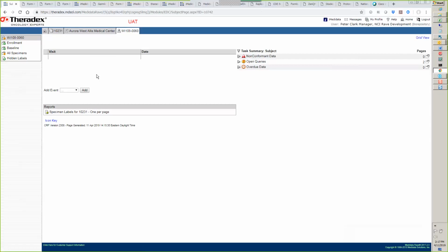Right. So that read-only all sites allows you to see all of the data, and as long as the study PI is fine with that, we would just go with that as your way of getting the data you need.